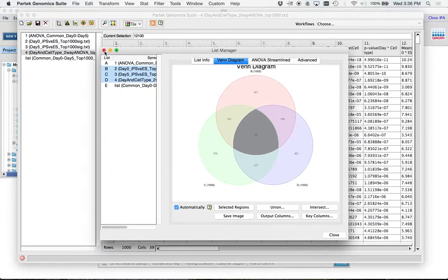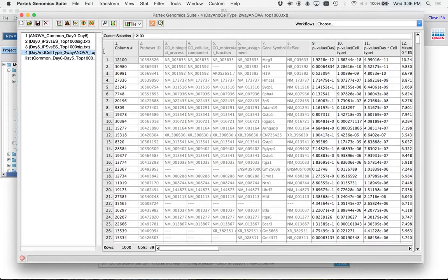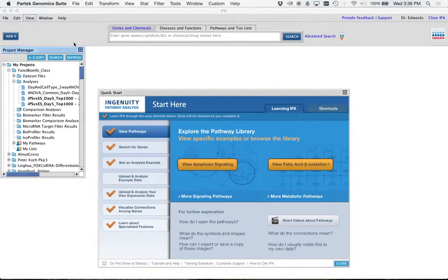Has everybody loaded in your gene list? Oh my gosh. If this was my high school class, half of them would be like, we were supposed to do that? This is awesome. Yeah. It's nice teaching grad students for a while, for sure. Okay. So you should have those gene lists in your IPA. Everybody has their IPA opened up, right?